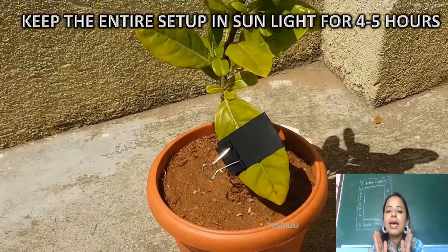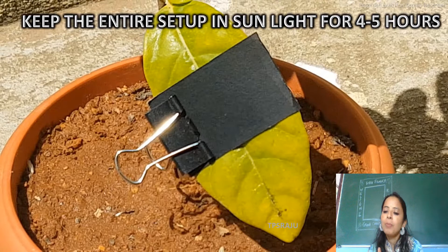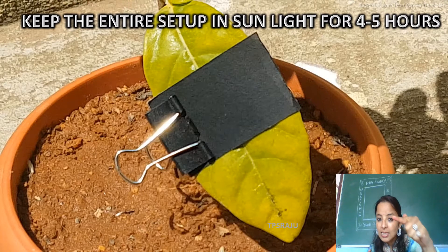After that, keep the entire setup again in sunlight for four to five hours for photosynthesis. Now we will come to know that photosynthesis does not occur in the dark portion covered by the paper.